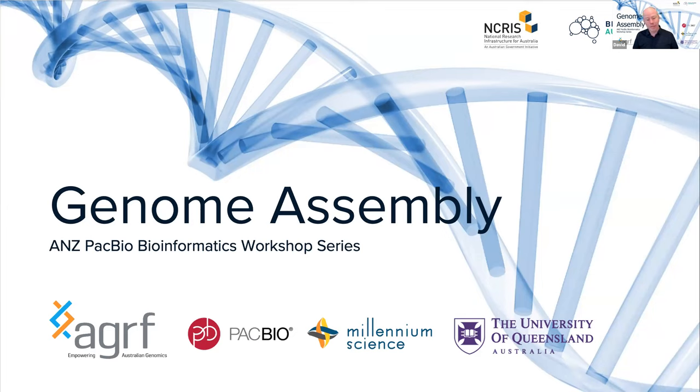What next is the question at the heart of today's seminar program. How do you take HiFi reads and generate a good contiguous assembly? What programs can you use? What if you want a phased contig assembly? What can you reasonably expect to generate and how easy is it to do? And I'm really excited about today's panel. We'll try and answer these questions.